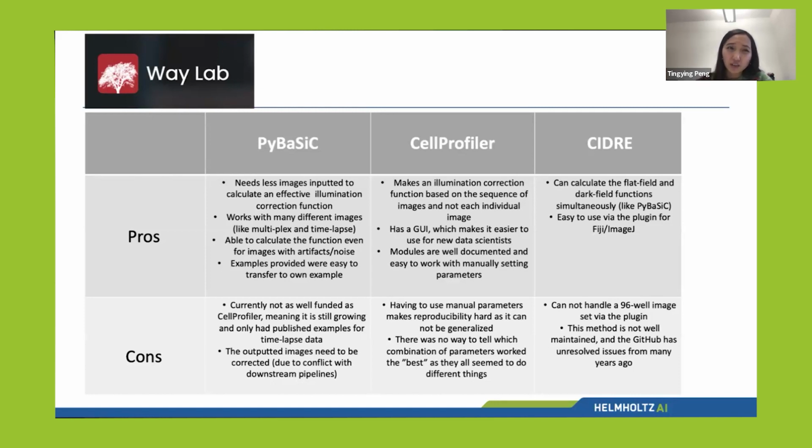Because sometimes we notice people commenting on the issues on GitHub. Sometimes if we have time, or we just want to get the BaSiCPy manuscript done, then maybe we answer. And sometimes if we don't have time, then we don't answer the questions, I have to admit. But if we get the funding for the software engineer, then we can do this in a more regular fashion.